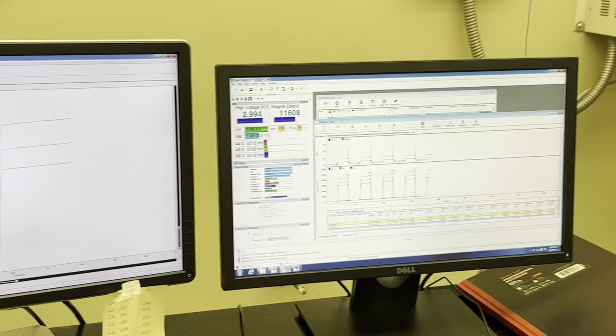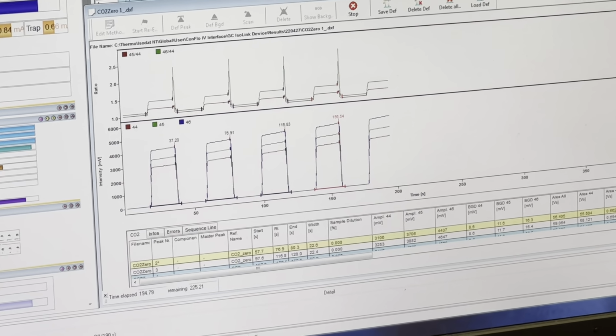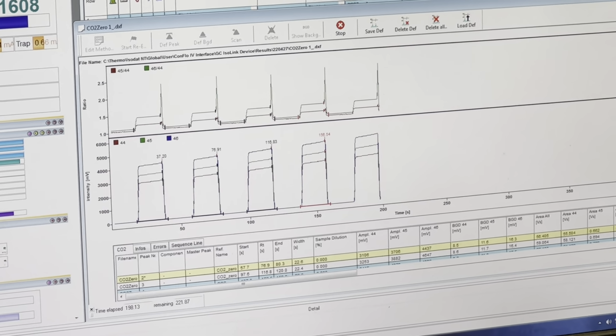They're supposed to have the same intensity, but sometimes I see pretty different. Yeah, I just think it's been closed for a while and you had the water, and it just needs to work the kinks out.